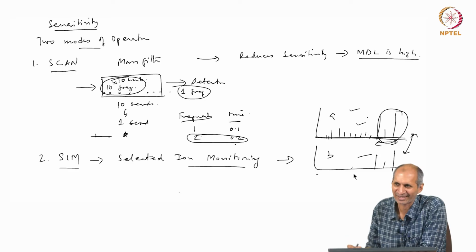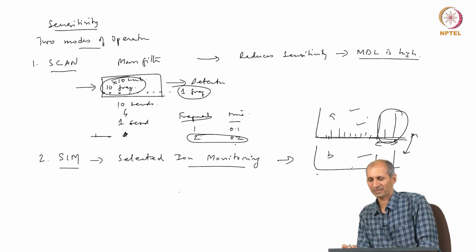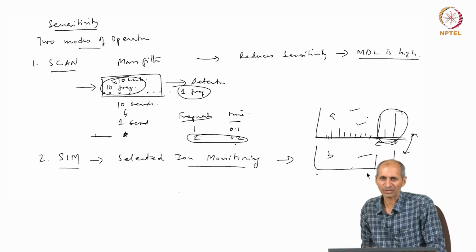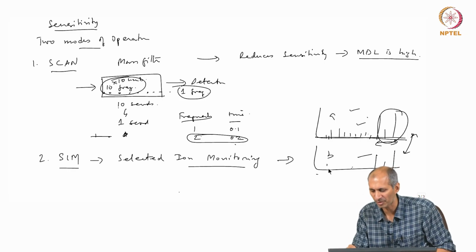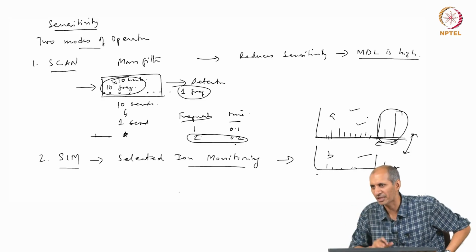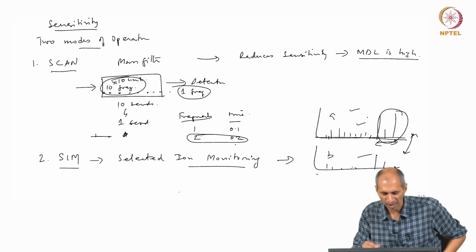I just discussed that. B is not the complete mass spectra of the compound, so it cannot be used as the signature. It's unreliable as a signature because it's a fraction of the entire thing. It can give you a large signal, but it doesn't contain all these peaks. So when you are doing a match, it will give you a 70%, 60% match. You are really not sure if it's that compound or something else, which means that you have to use SIM.